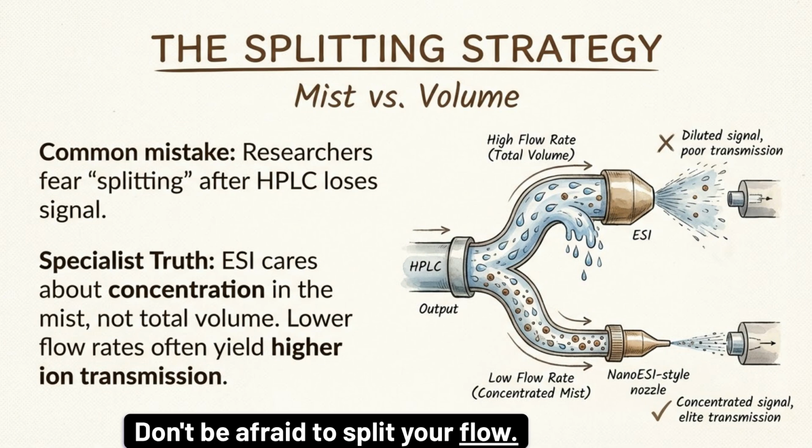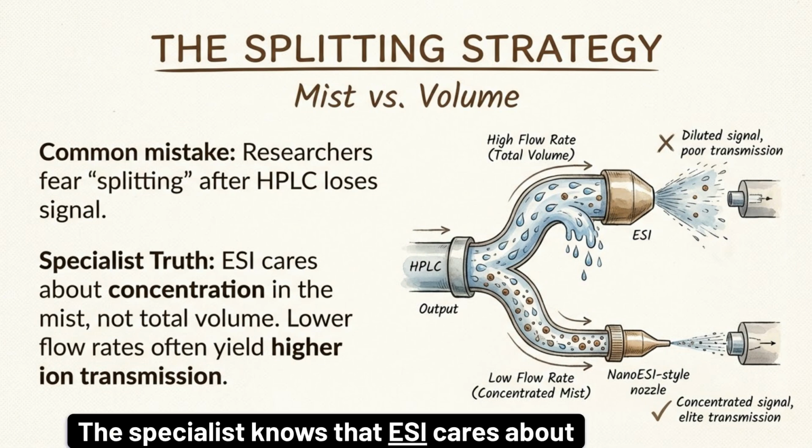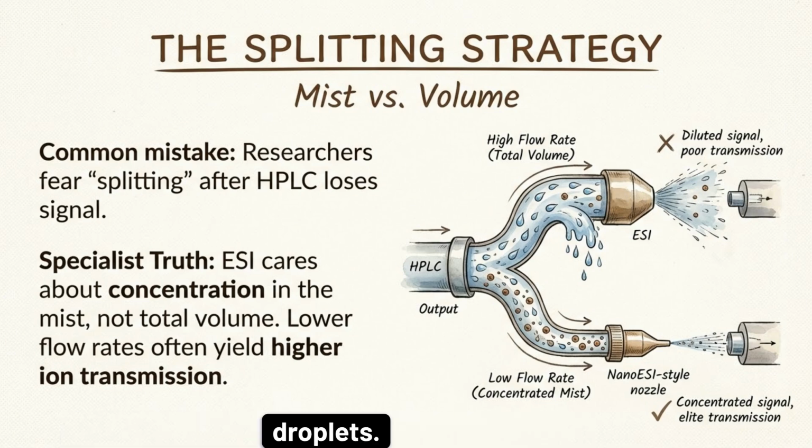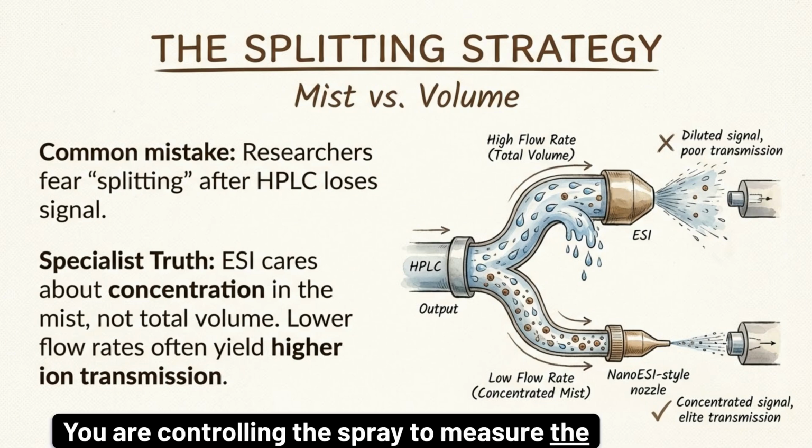Don't be afraid to split your flow. A specialist knows that ESI cares about concentration. Lower flow leads to smaller, more efficient droplets. You are controlling the spray to measure the giant.